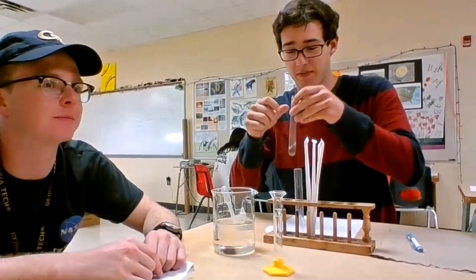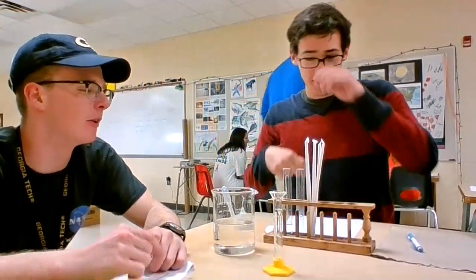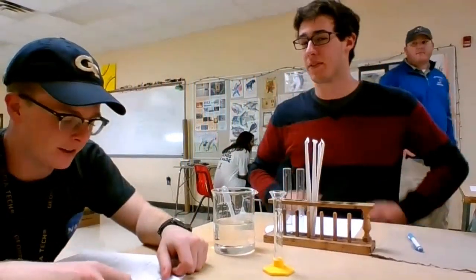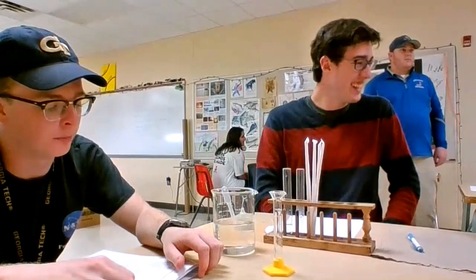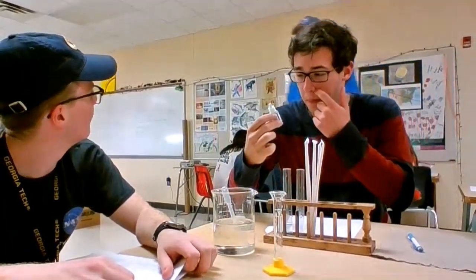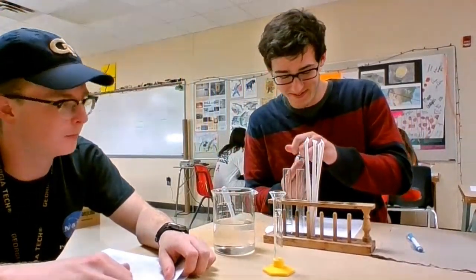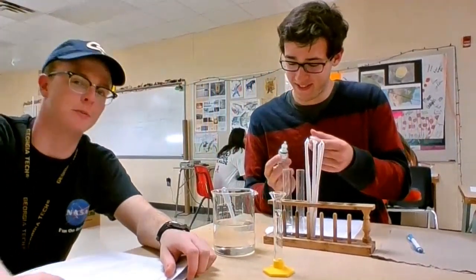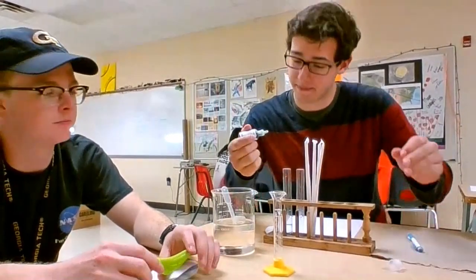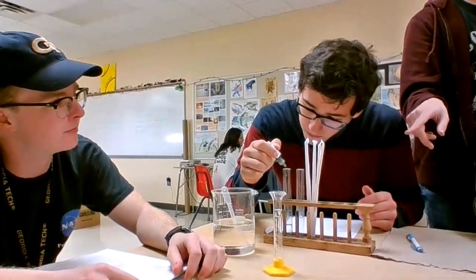I got it clear. Okay, hit me up with that next one. All right, add one drop of bromothymol blue, because mine was more. A single drop. Okay. One drop. Yeah. What do you need a straw for?